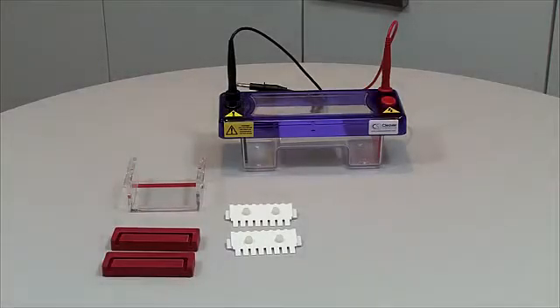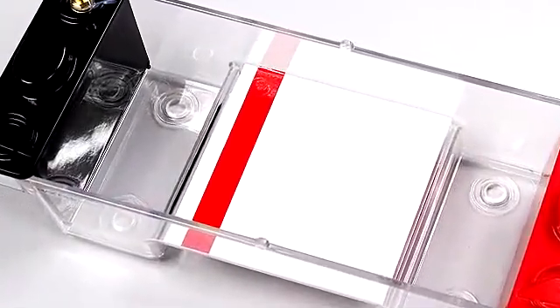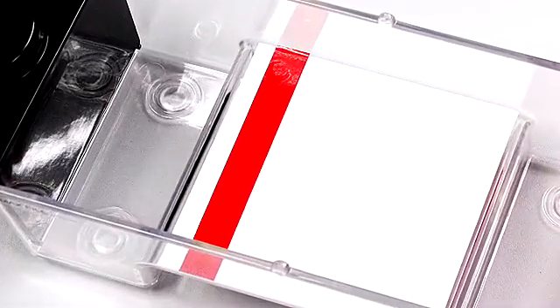This is what you will need: MS mini tank and lid with cables, combs, casting dams, and gel tray with red tape on the underside. If you prefer, the red tape may be adhered to the platform of the gel tank, especially if you intend to view the gel while still on the tray in a UV transilluminator.